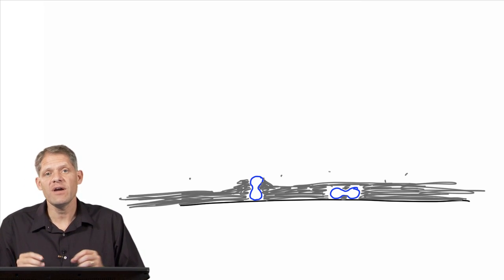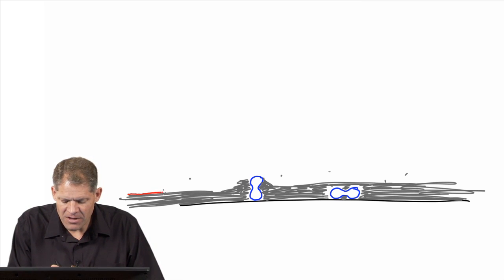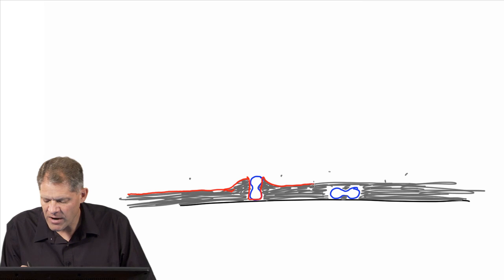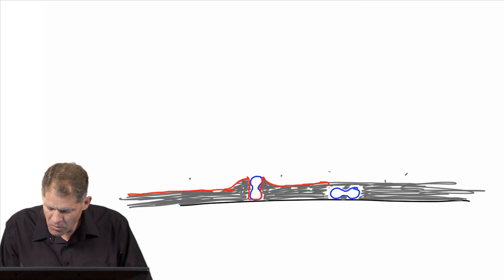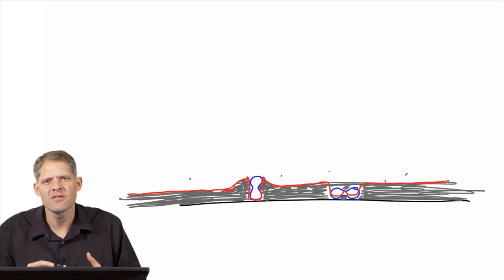As a result, there will be very high contrast where the proteins were. The depth of scattering material in the background will be relatively constant, but then right around a protein, that depth will rise strongly and then drop immediately right around where the protein is, and so create a very high contrast object. Elsewhere, if a protein is buried in the stain, what you see is the absence of stain in that spot. You see basically a hole in the stain with maybe areas where the stain is deeper, and then it goes back into background. And so the stain tends to highlight the particles.